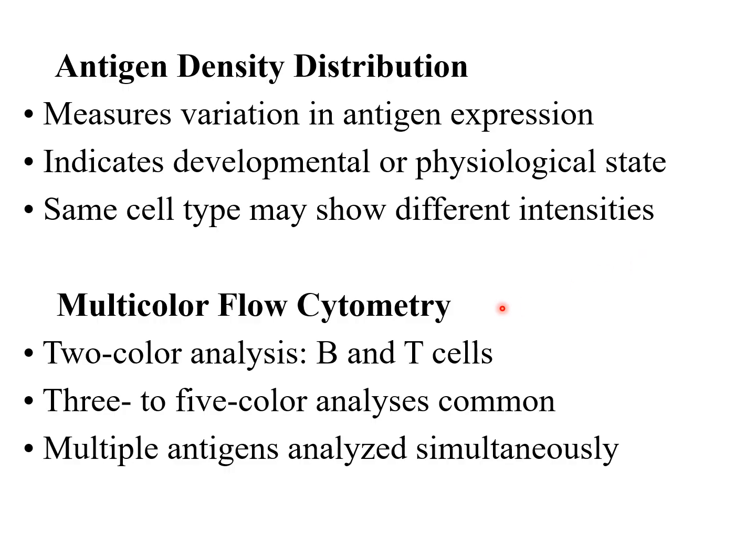In multicolor flow cytometry, two color analysis is there. One can differentiate B and T cells. Moreover, 3 to 5 color analysis is also common, and multiple antigens can be analyzed simultaneously.